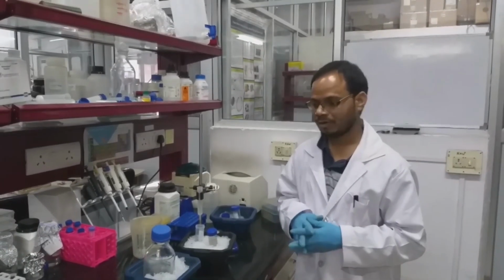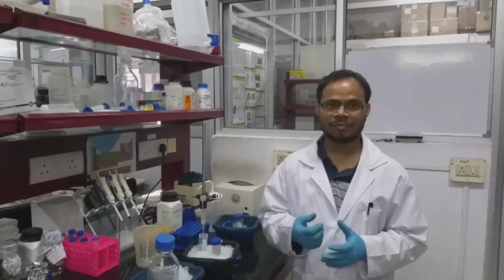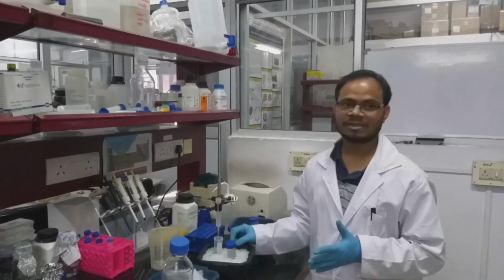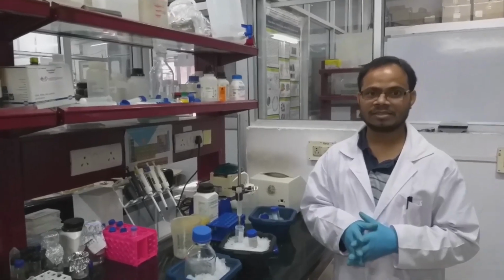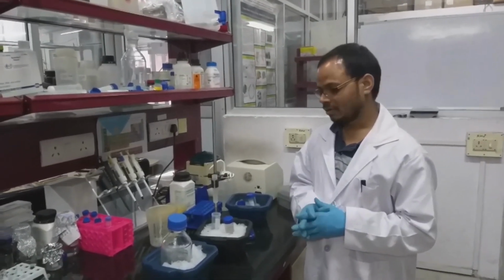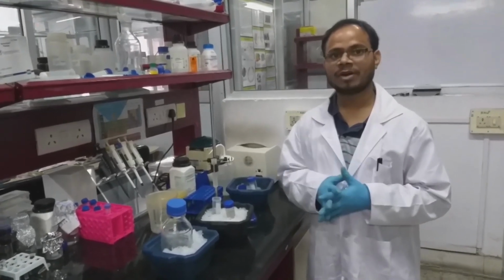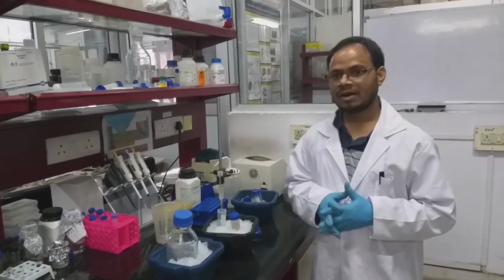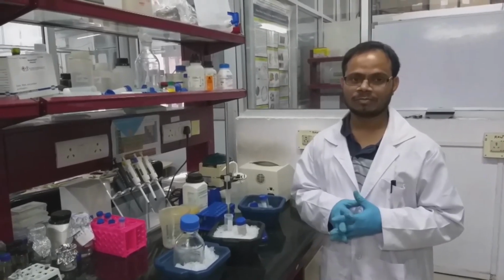While doing purification, we have to remember that every time you are introducing a new buffer, you have to collect the fraction, and this can be used for running SDS and testing the purity of the samples. Also, the flow through and the washing fractions that we have collected, we have to keep safely. Only after verification of the gel should we throw them away.